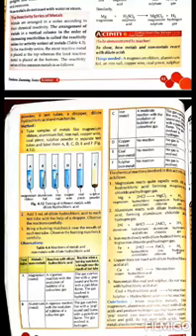For recording observations, students, you may draw a table with different columns titled as test tube, metals or non-metals, reaction with dilute hydrochloric acid, reaction when a burning matchstick is brought near the mouth of test tube. These may be 4 titles.